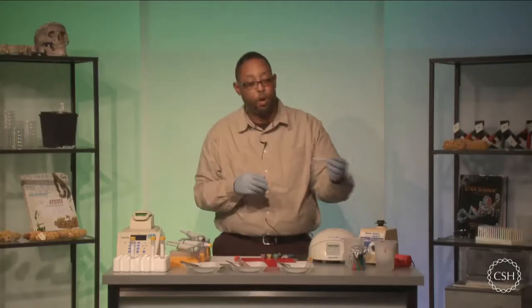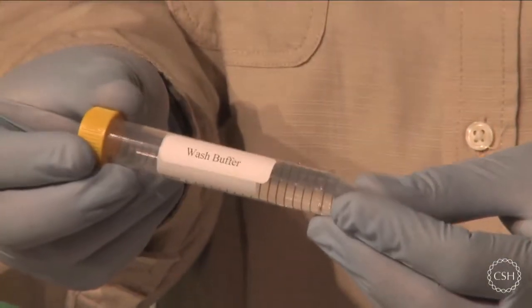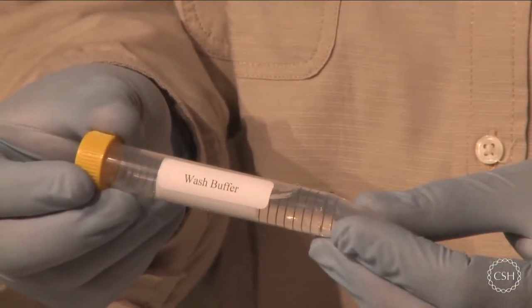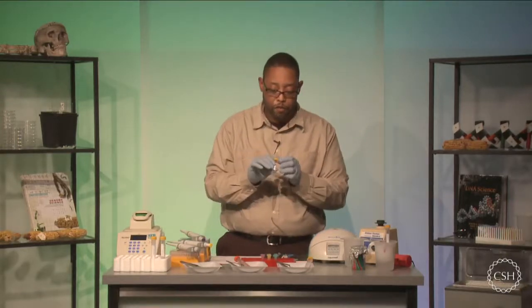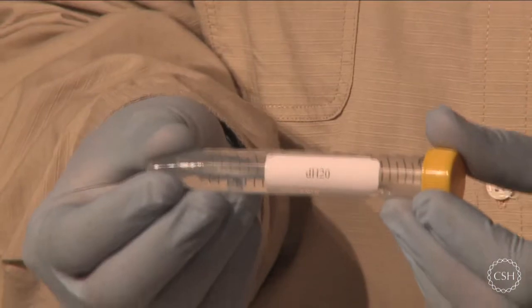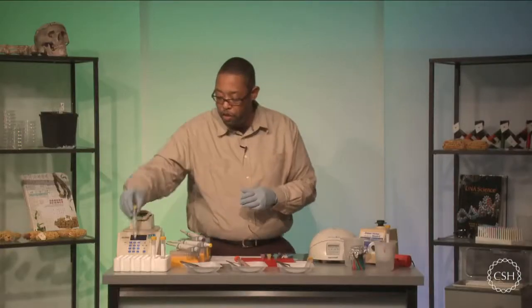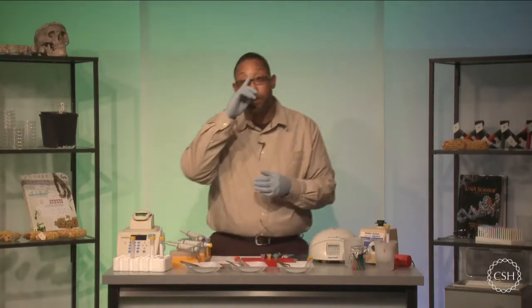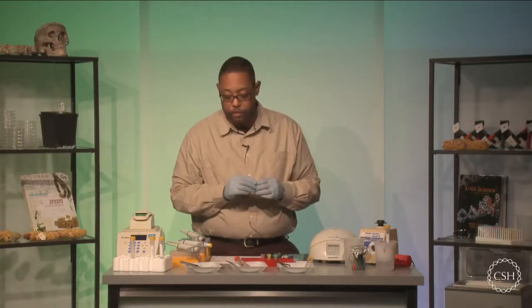We're going to need wash buffer, which I usually keep on ice. It should be very cold when you do this reaction. So you are going to need some wash buffer for this particular experiment. And then lastly, we're gonna need something to elute the DNA off of our silica resin, and we're just gonna use distilled water for that, okay? Now, of course, my test tubes are really large, but yours may be small because you only need small aliquots to actually proceed on with this experiment. But nonetheless, we have all the reagents that we physically need here.